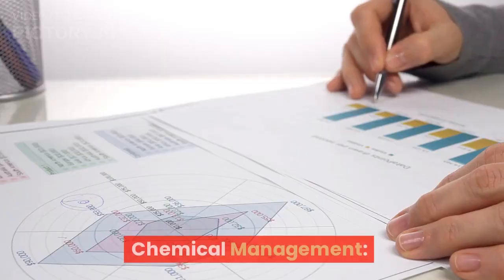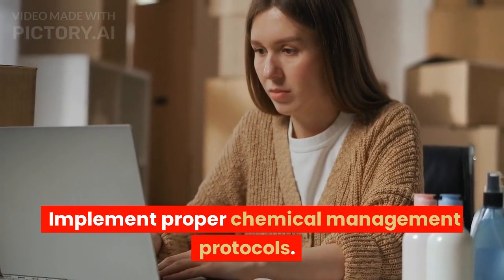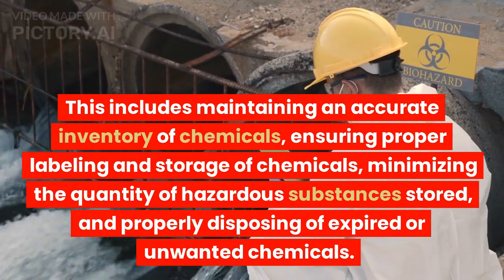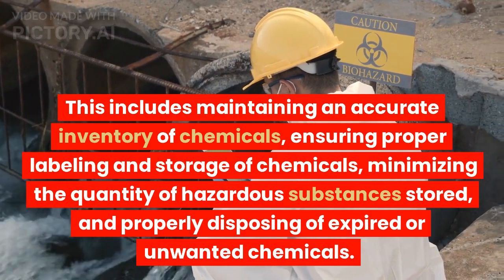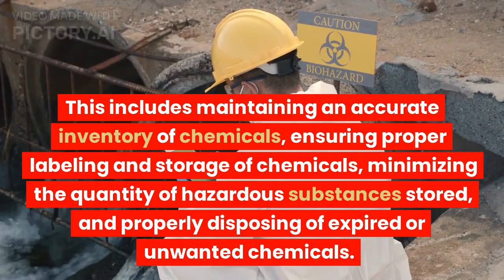7. Chemical management. Implement proper chemical management protocols. This includes maintaining an accurate inventory of chemicals, ensuring proper labeling and storage of chemicals, minimizing the quantity of hazardous substances stored, and properly disposing of expired or unwanted chemicals.